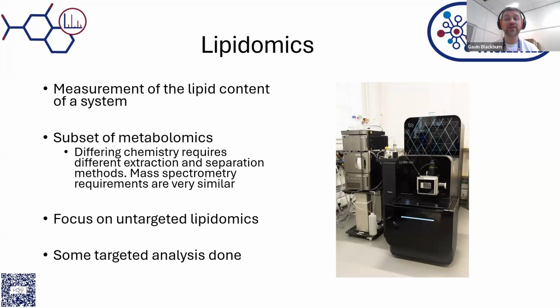For the mass spectrometers themselves, the requirements are very similar. Lipids just have a higher mass range. We use one of our TOFs for our lipids. It's the multireflectron TOF that we get really nice lipidomics data out of. We've actually done shootouts across all of our different Orbitraps and TOFs for these different things, and we feel like we get our best lipidomics data out of this instrument. So that's what we run our lipidomics samples on.